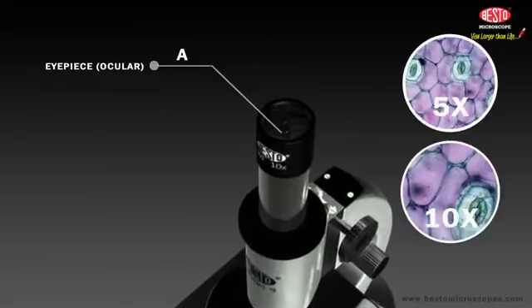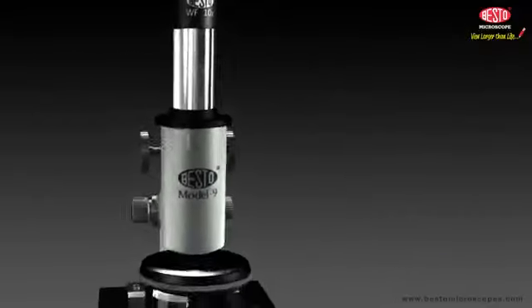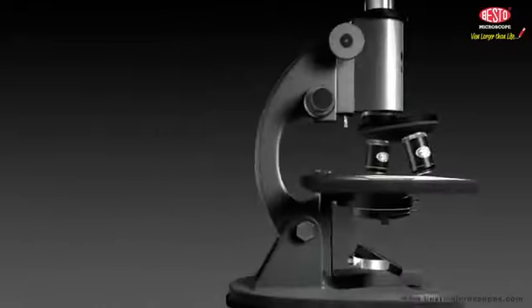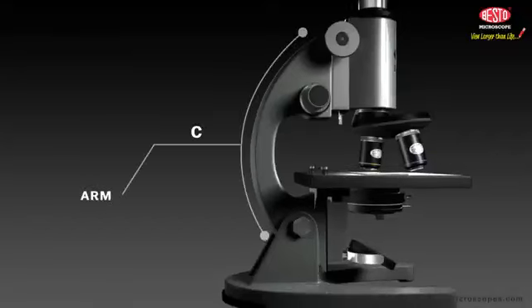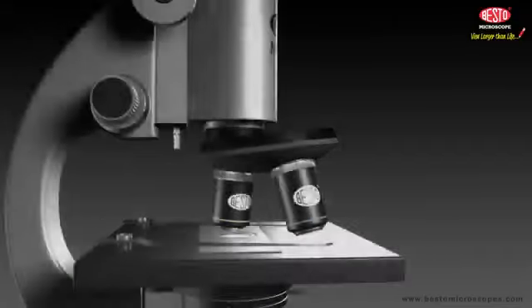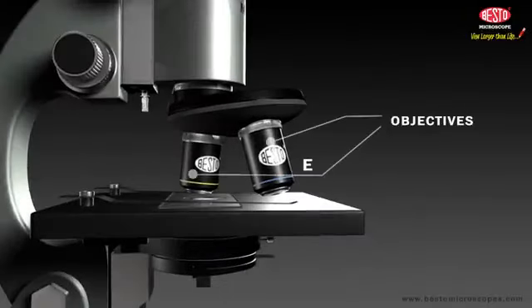or 10 times. B. The body tube holds the eyepiece in position over the revolving nosepiece and the objectives. The body tube may be straight up and down or slanted. C. The arm is the curved metal piece that holds the body tube in place over the stage and the base. D. The revolving nosepiece holds the objectives and allows you to change objectives while looking at a slide or sample.